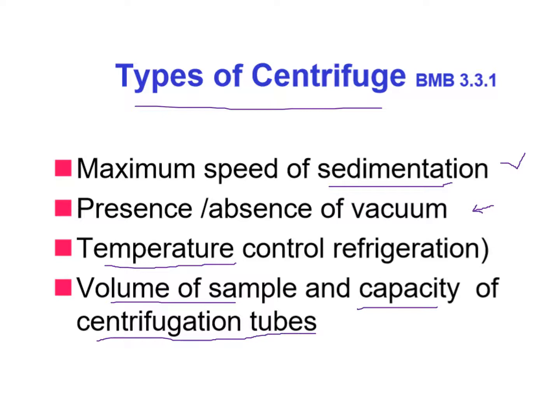These are not just paper cup tubes. These are hard plastic that can withstand obviously high levels of force. And the force levels determine the type of centrifuge tubes and their makeup. So you have to order special tubes from the makers here.